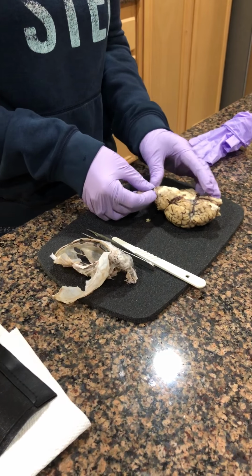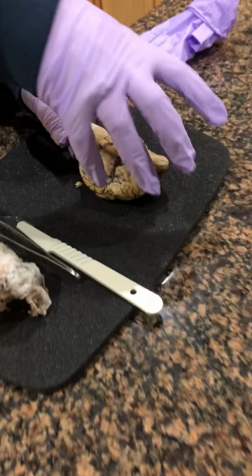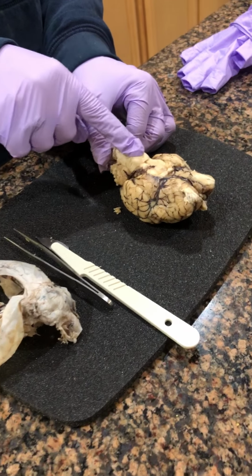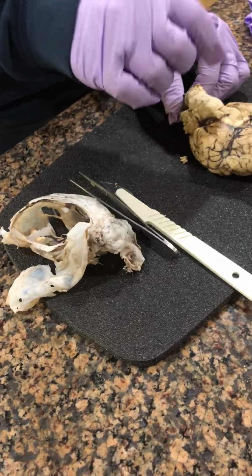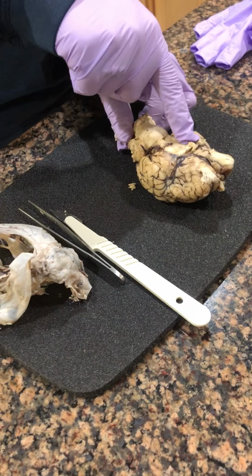And this is, mine fell apart right here. So first, this is the cerebellum, all this right here. And this would be your medulla oblongata. Up here is your pons. This was the meninges, would have been next. Here is the midbrain, kind of in the middle right here.